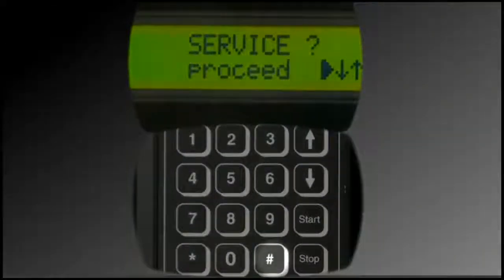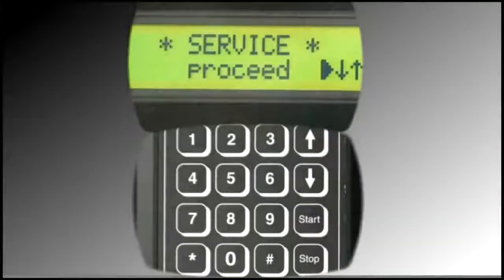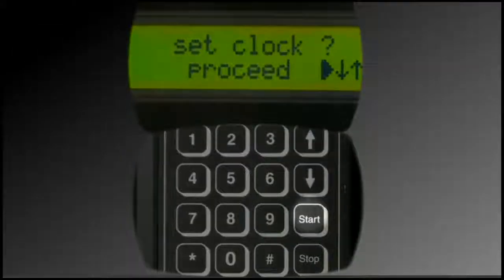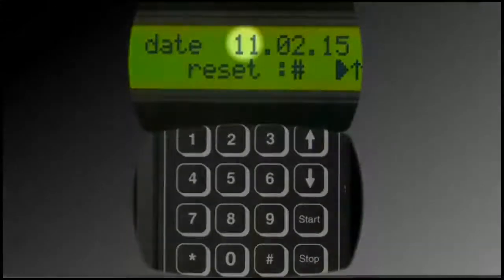Press the pound icon. Press the 7 button. Press the up arrow. This is where the date and time can be set. Press Start. The date is visible on the display screen. It represents, from left to right, the day, month, and year.